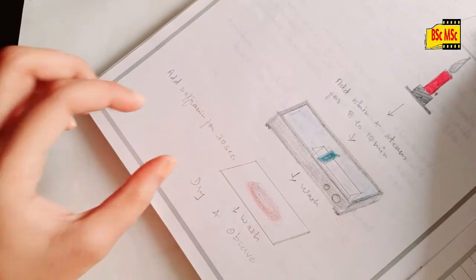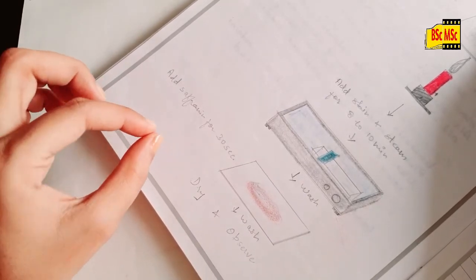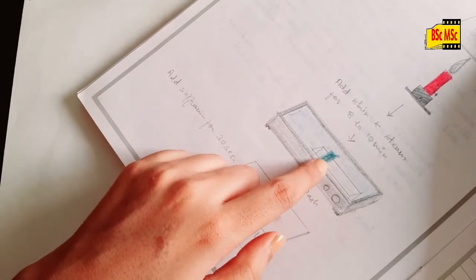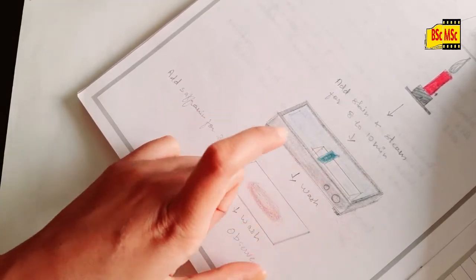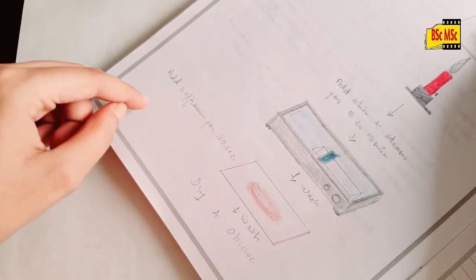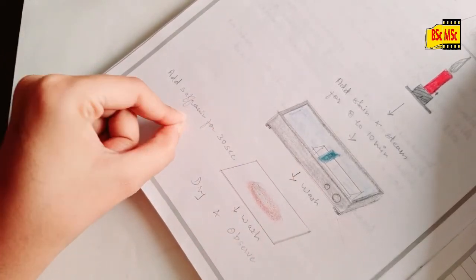Because the vegetative cells, the parent cells, will be stained with the safranin, not with the malachite green, because the malachite green has washed away after the distilled water washing. That is why we use the safranin stain.